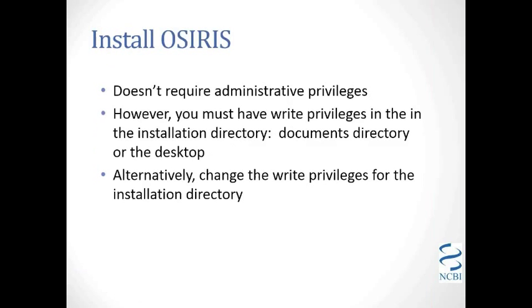When you're installing OSIRIS, it does not require administrative privileges. However, you do have to have the right privileges in the installation directory that you put it. So, for example, in your documents directory or on the desktop directory, you have write privileges. Those are good places to put it. Alternatively, if you put it into something like the programs file on a PC, you can change the write privileges for the installation directory.